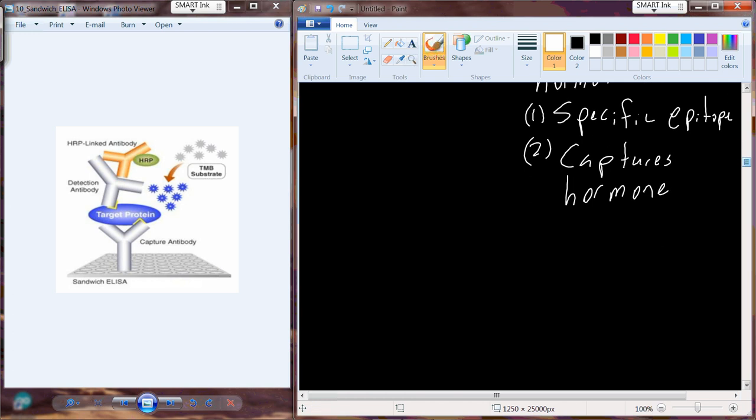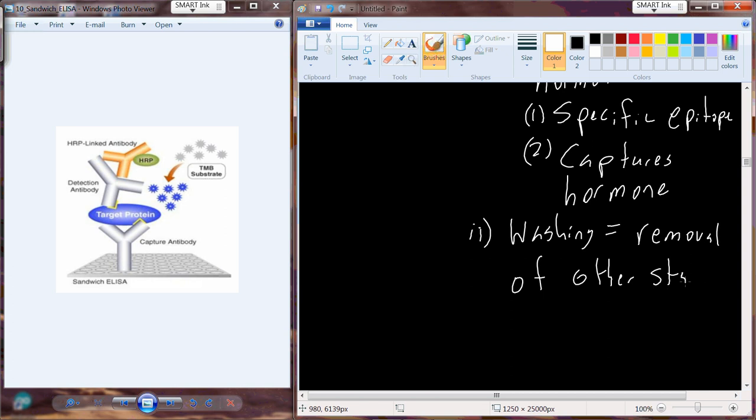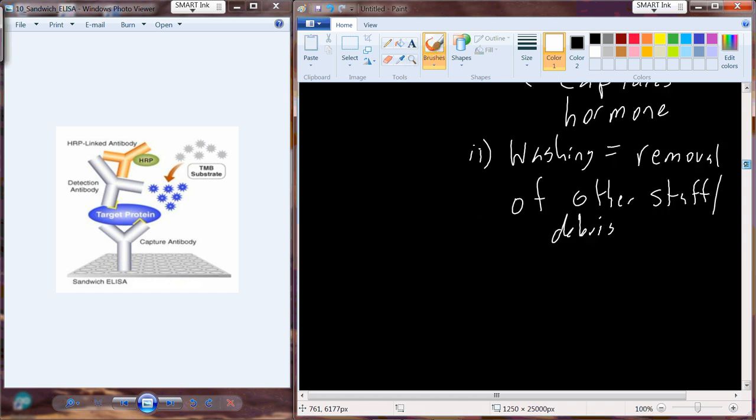Now, when we put that hormone solution in there, we're not just putting in the hormone. We have other stuff. We have our extraction buffer or analyte, whatever we put in. And so we have to get rid of the stuff that didn't bind, that wasn't hormone, or wasn't molecule of interest. And so there's always going to be a washing step. And this washing step is done to remove the other stuff or the debris. And so hopefully by this point in the process, we have our hormone of interest bound up to our capture or our primary antibody, and everything else has been removed.